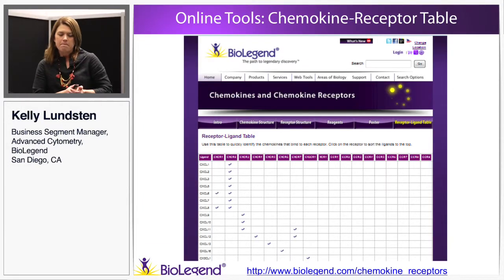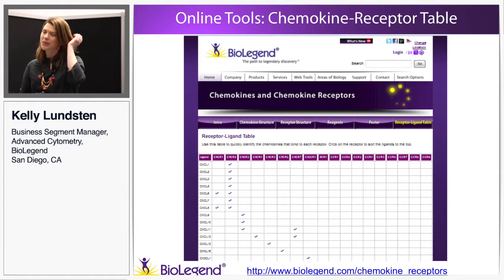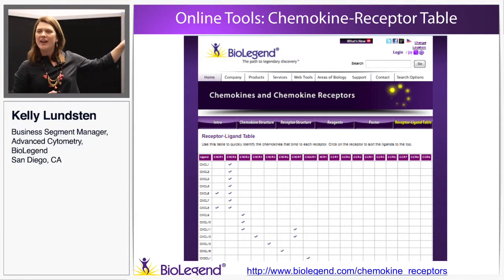All right, so we have a few tools online that I used heavily. I always give the caveat that I am not an immunologist. I work at BioLegend, and it never ceases to amaze me that I work at an extremely immunology-dense company. My expertise really is fluorescence chemistry and multicolor flow. So I rely very heavily on my colleagues and on our online tools like this. This is a chemokine receptor table.